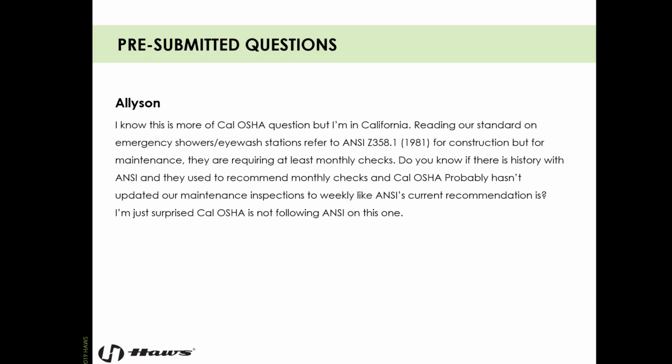Agreed, Allison's hit the nail on the head. It's surprising to us too. This is a rare instance where California is behind the curve on following these requirements. Cal OSHA definitely needs to update that date to say 2014. I've tried myself, Allison, but for some reason they continue to reference the 1981 standard. Realistically, most of the state follows the 2014 standards anyways, right? Better to be ahead of the curve and provide equipment that is functioning correctly and providing proper first aid than not.